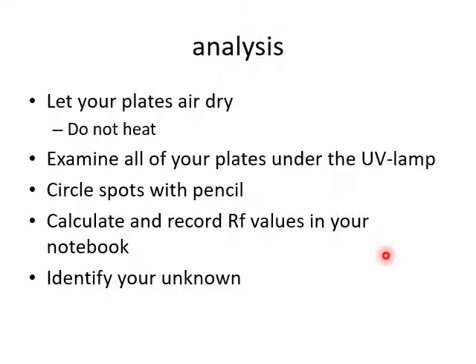After finishing, you need to let the plate dry at room temperature. You should not heat it. And then you need to test it under a UV lamp, circle the spots with a pencil, and calculate the retention factor. Based on the retention factor, you can identify your unknown mixture. As I mentioned, you usually have three different compounds in your unknown, and based on retention factor, you can identify each of them.